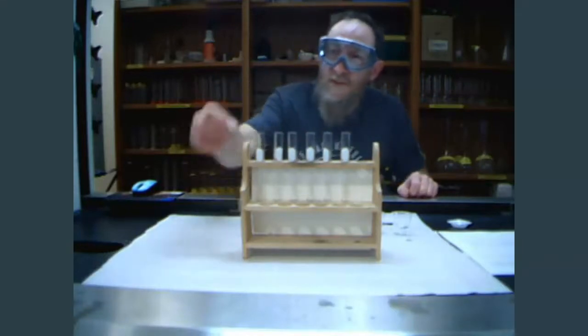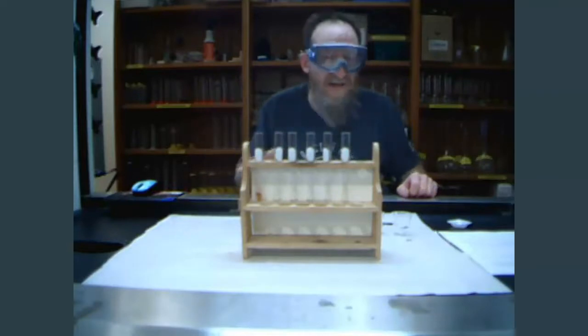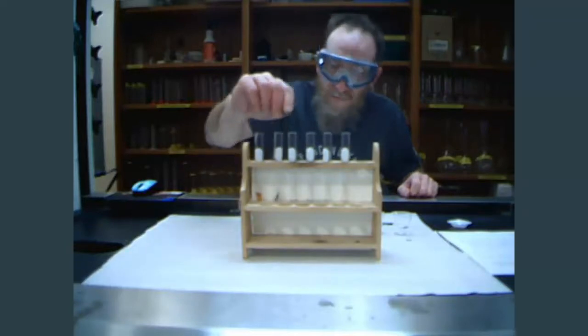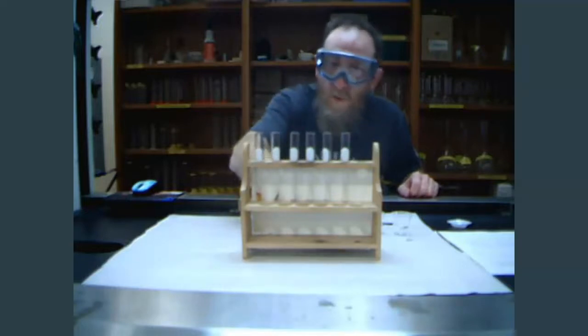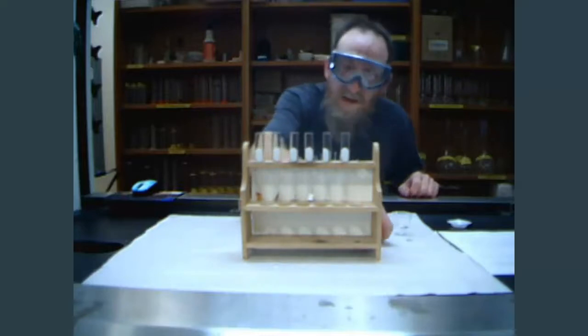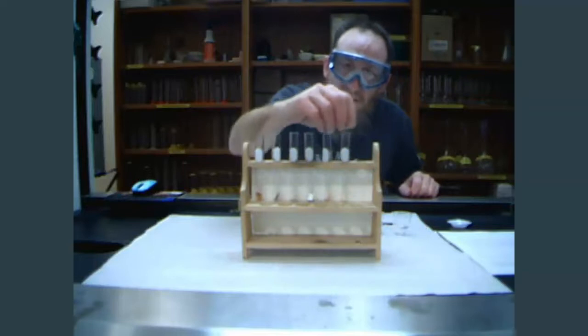In test tube number one, I'm going to put a little piece of copper. Again, I've already sanded these so they're nice and shiny. In the second test tube, I have some lead. In the third test tube, a piece of zinc. In the fourth one, also a piece of zinc. And then in the fifth test tube, a piece of copper. And in the last one, again, zinc.